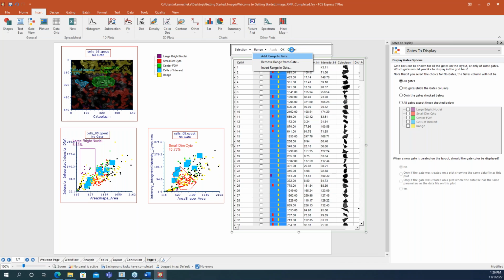All right, now I forgot to turn off my auto save. So that's another feature to let you know that we do have. If you're working in FCS Express and working through your analysis, we do have the ability to do some auto saves in case you need to step away from your computer or something comes up. You can have the ability to save your data and then keep moving forward as you work through your workspace.